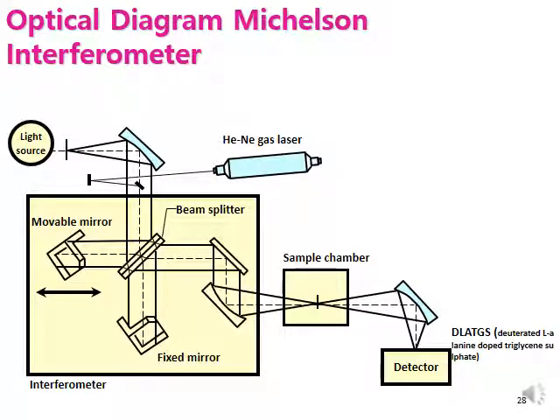After that, it focuses the whole light source, so the light will focus and will not disperse. After passing through these many mirrors, it will go to the sample chamber, where near 100% of the infrared light is passing through the sample.